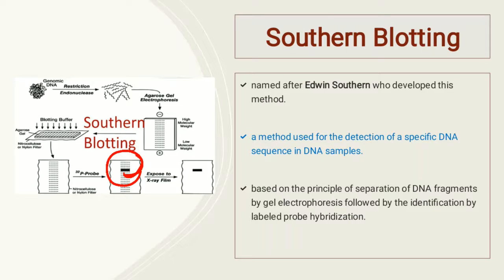with the help of which we can easily visualize our targeted DNA onto the filter paper. Next, after applying the probe, we will expose the nitrocellulose membrane to X-ray film, with which it will produce a glow because it is radiolabeled. So we will easily visualize our targeted DNA on that nitrocellulose membrane. So this was all about the southern blotting.